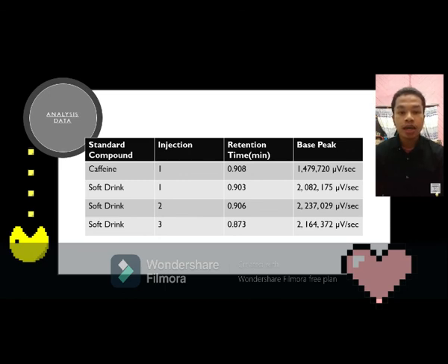Either the peak height or the peak area can be used to estimate the concentration. This can be done because these values are proportional to the concentration when the peaks are sharp and the flow rate is carefully controlled. A calibration curve can be prepared by plotting either peak height or peak area as a function of concentration. Last but not least, we can calculate the concentration of caffeine.